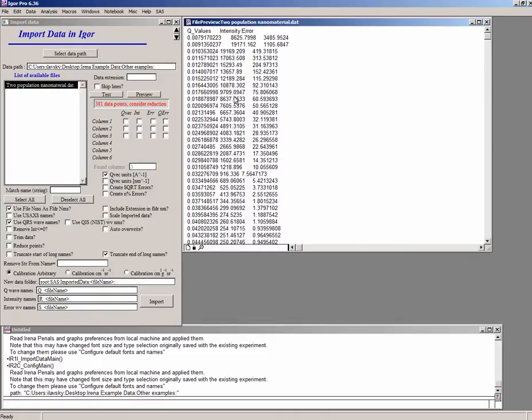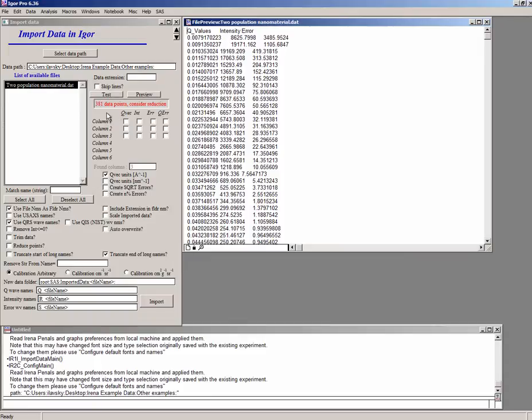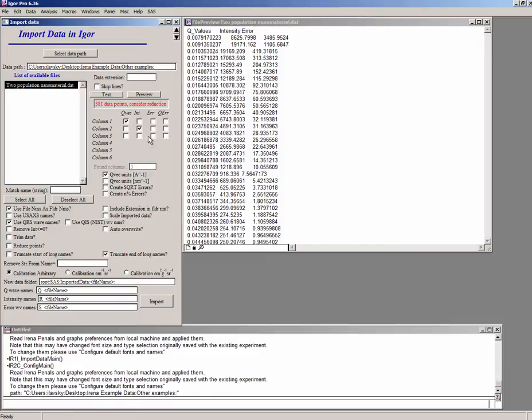The other thing to note is that these numbers look kind of high and we do not have any information if the intensity is d sigma d omega in calibrated units or not. So we will assume it's not. It's not calibrated data. So what the IRENA needs here is to know which column of the data is Q. So that's the first one, intensity and error.